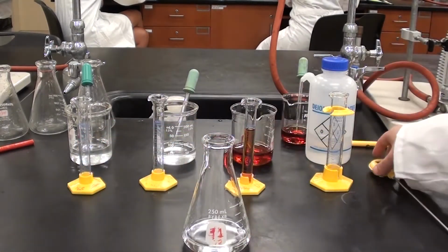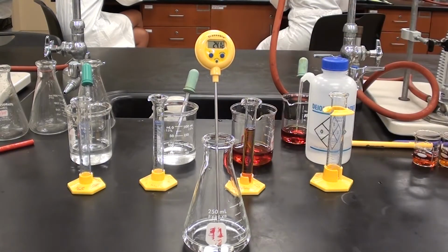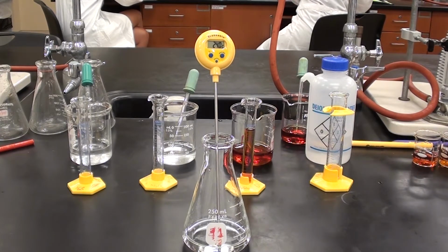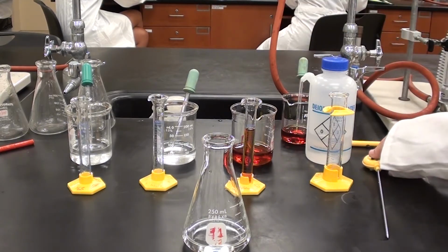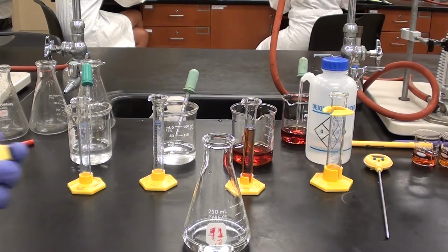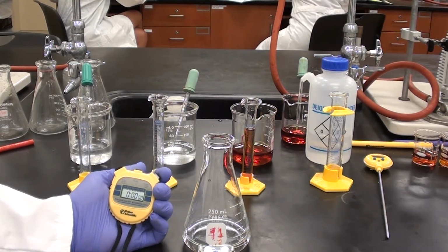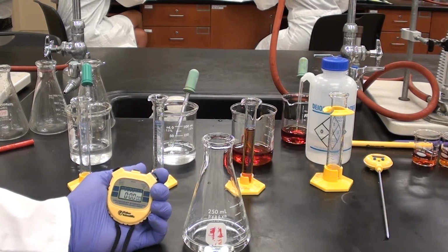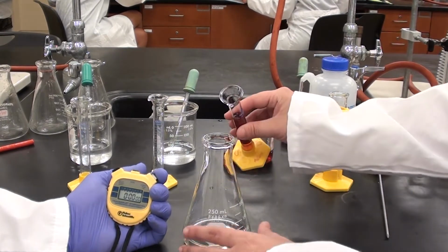Taylor's going to go ahead and get a temperature on that. We're going to wait for a couple of seconds while it stabilizes, and then Taylor will mark down that temperature in her lab book. Looks like it's stabilized. We can go ahead and take it out. Now what's going to happen, could you please put the stopwatch in the shot here? Samuel's got a stopwatch, and he's going to hit that timer as soon as Taylor pours the iodine into the solution. She's going to do so fairly quickly. Would you please go ahead and do that, Taylor?